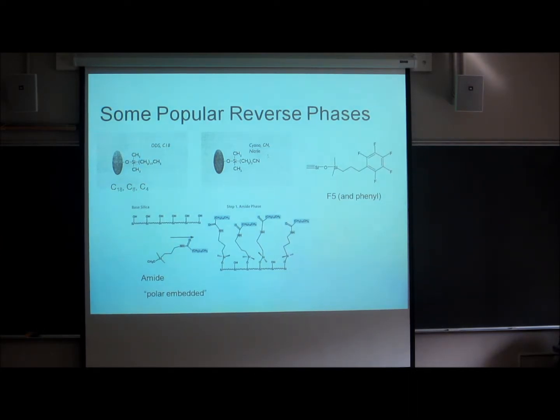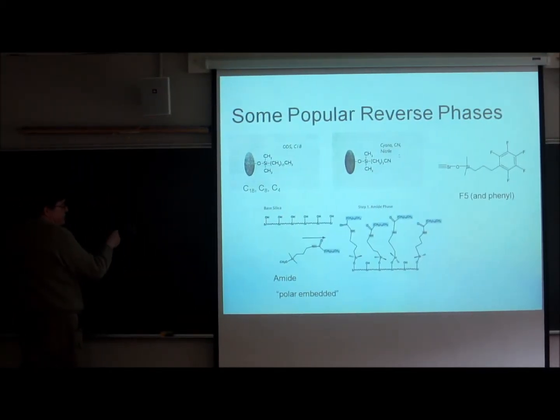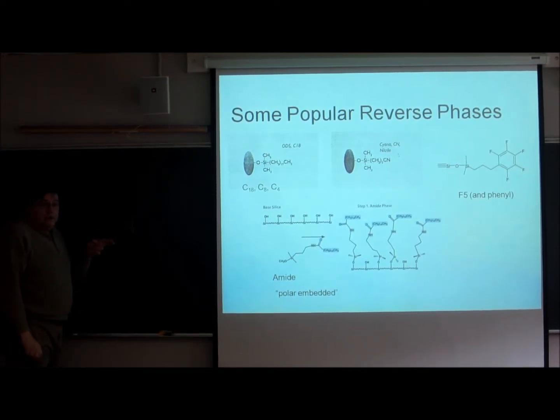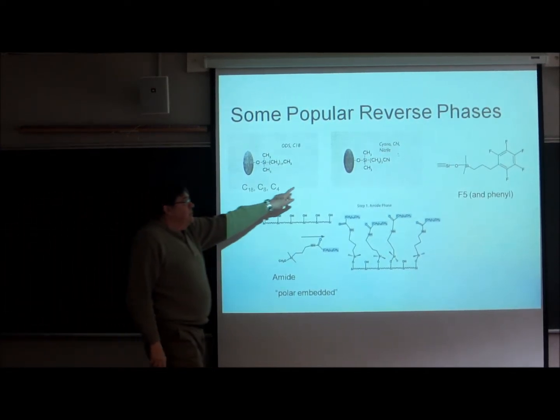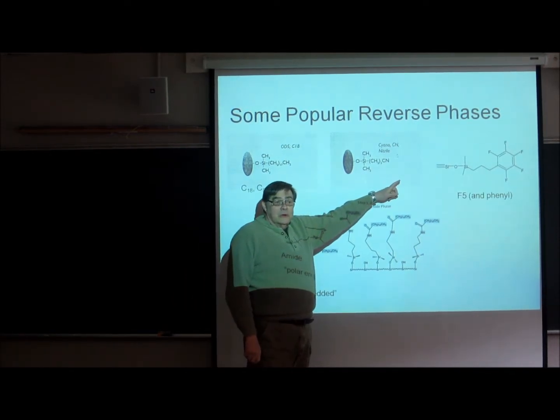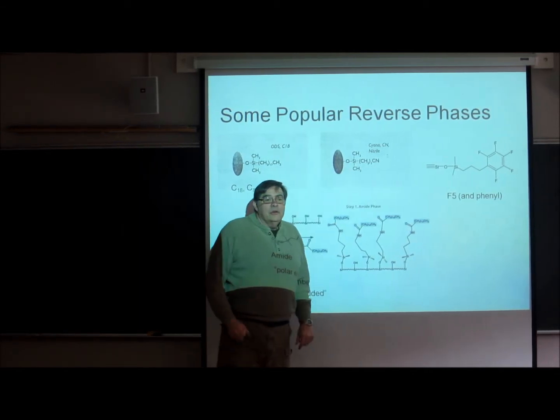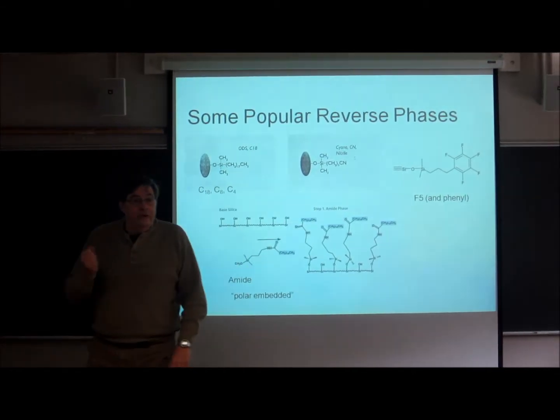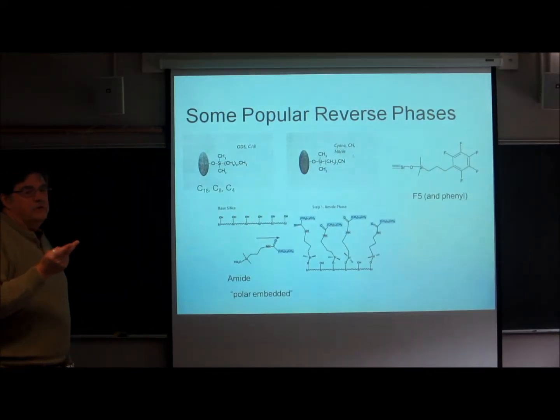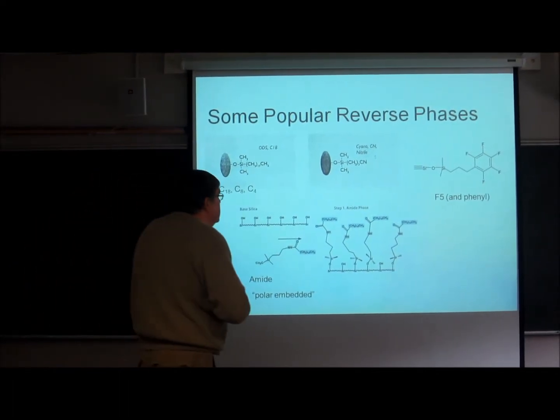And what do we have for electrons? No more extra electrons around here. Lewis theory, there's 8 electrons, but a pair of electrons there. So a pair of electrons sticking out from the stationary phase. So this is going to be a more polar reverse phase column. And this will select toward more polar solutes that move by. It's not an acid base reaction, but you can have polarization occurring from these electrons. They can polarize other molecules near them.